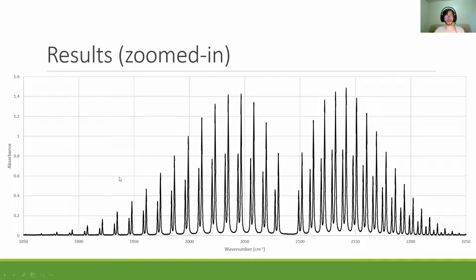Now I want to talk about the general curve here. The curve comes from the Boltzmann equation. We know that the likeliness of different transitions depends on the population of the state before the transition happens, and the energy it takes for that transition. So if we look down here, it really doesn't take much energy. So you would almost intuitively think that this transition should be really likely to happen. But at room temperature, we're already at the higher energy states of rotational energy levels, because it doesn't take much energy.